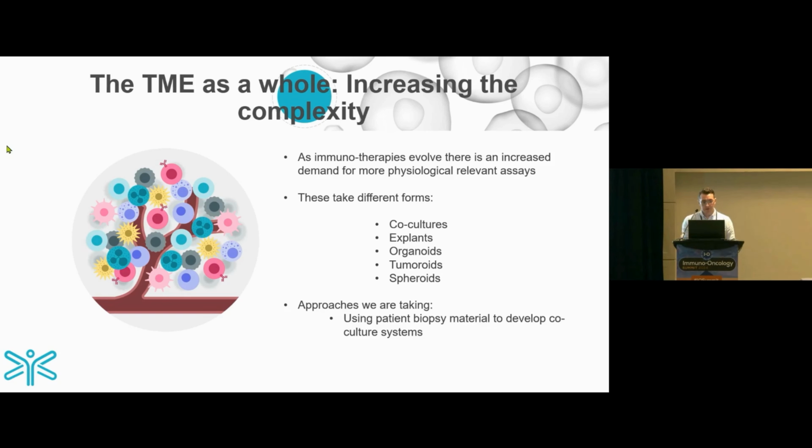So we're currently starting to develop our own approaches, and it's very preliminary. It's just to give you a flavour. But we are now using patient biopsy material to develop these types of co-culture systems to hopefully develop 3D assays.